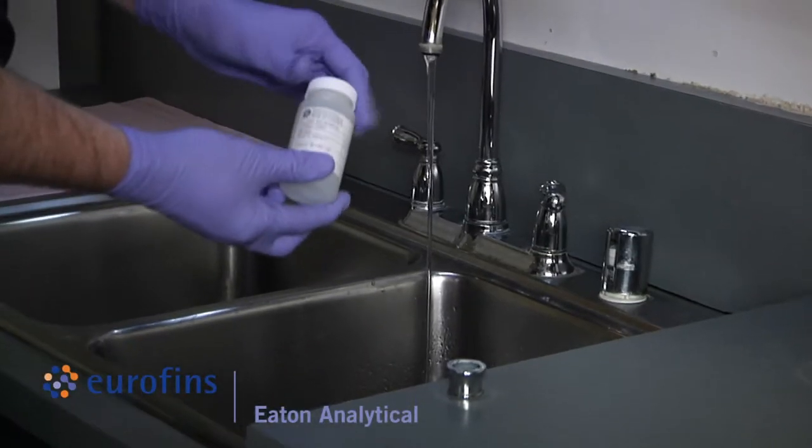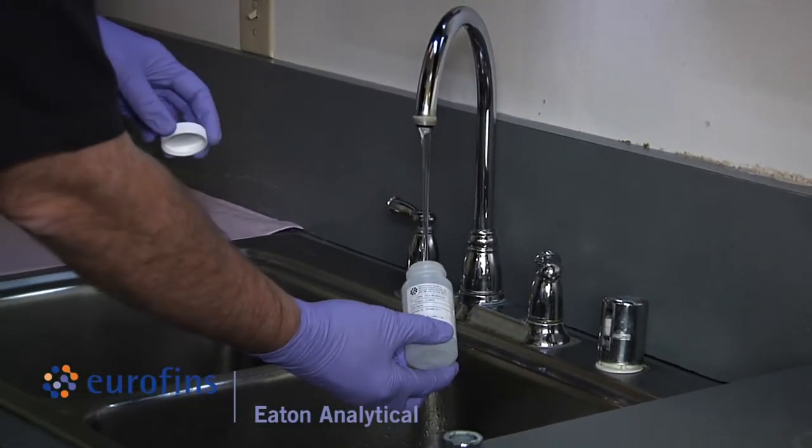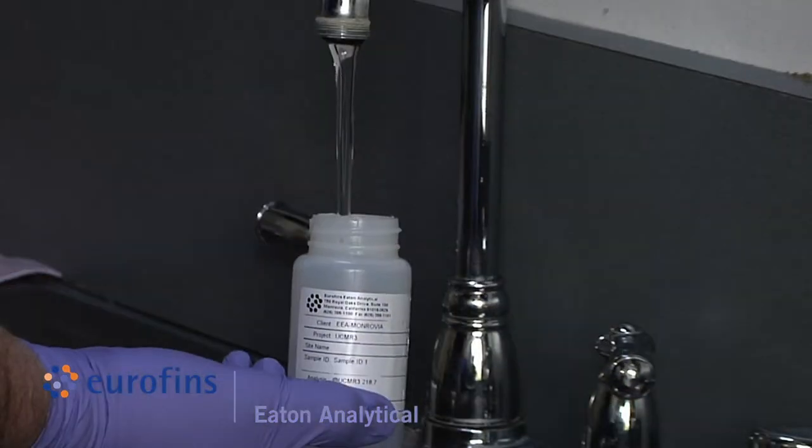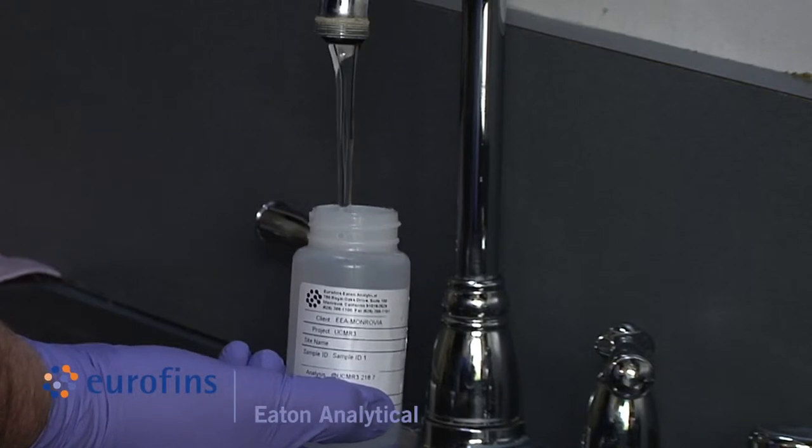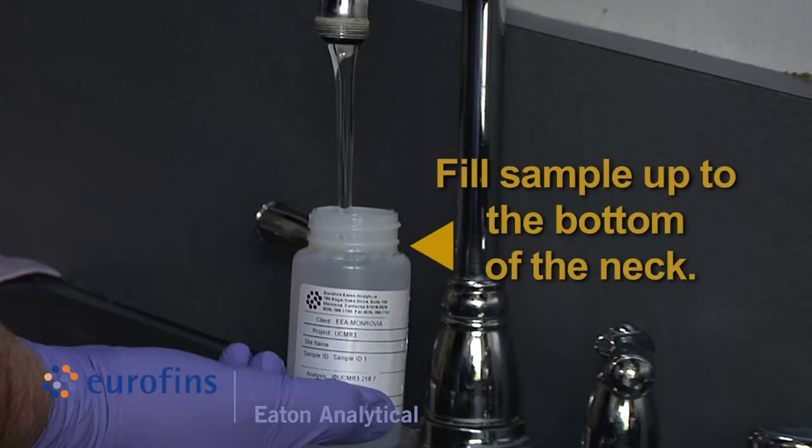Start sample collection by filling the sample bottle up to the bottom of the neck, taking care not to flush out preservatives, and making sure the mouth of the bottle does not come in contact with anything other than sample water.